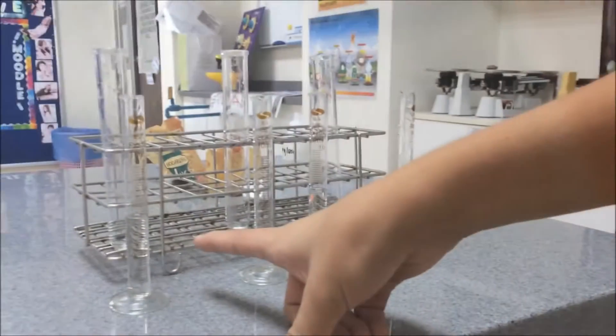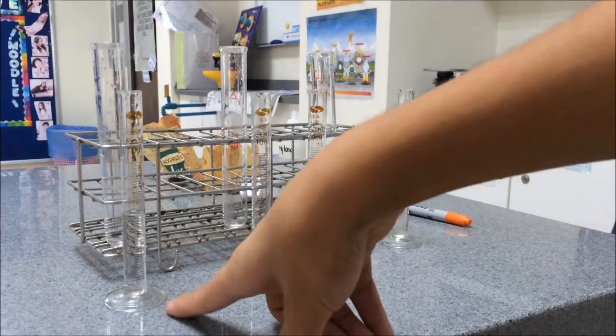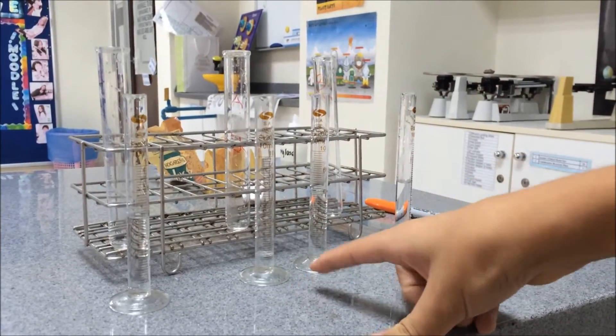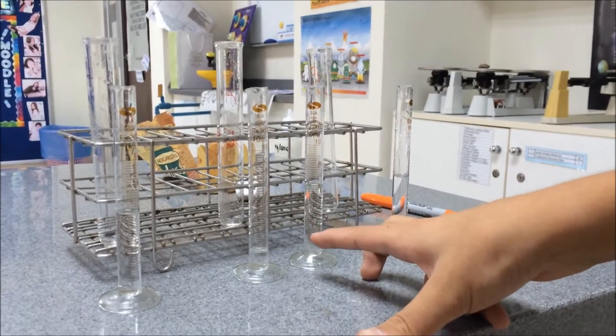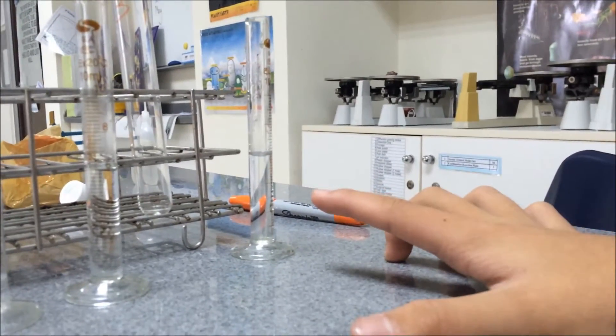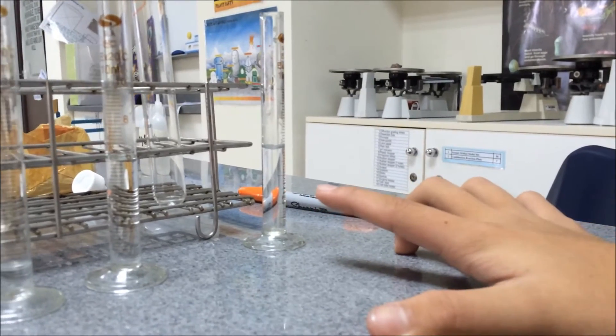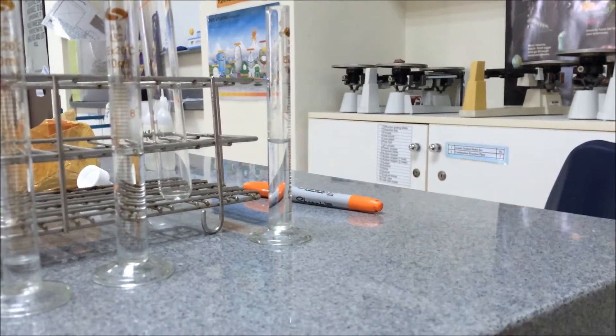In the first tube we have six milliliters of water, in tube number two we have six milliliters of 0.2% amylase, and in the third tube we have six milliliters of amylase and 20 drops of hydrochloric acid.